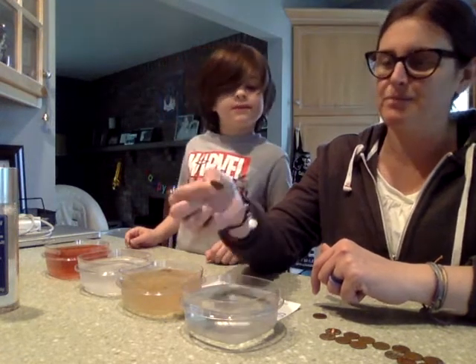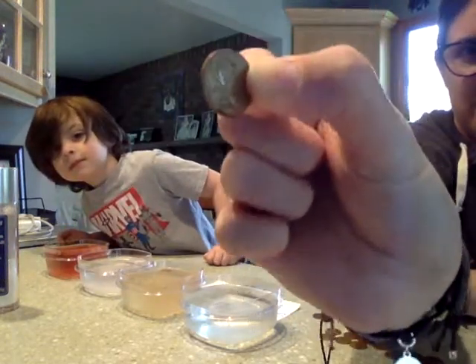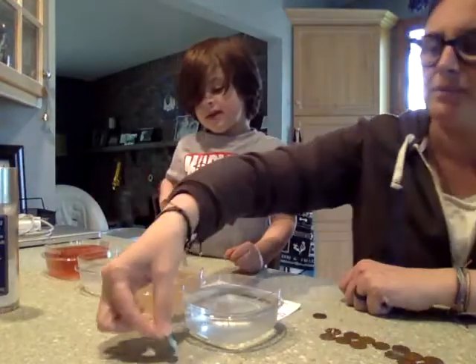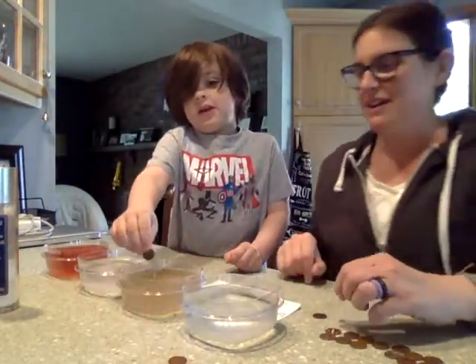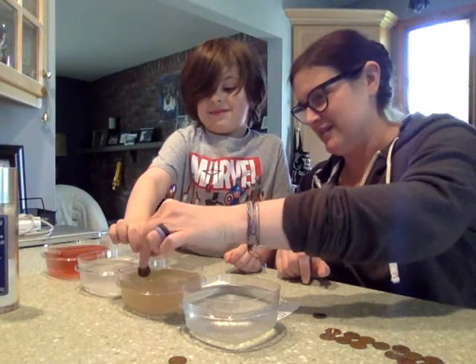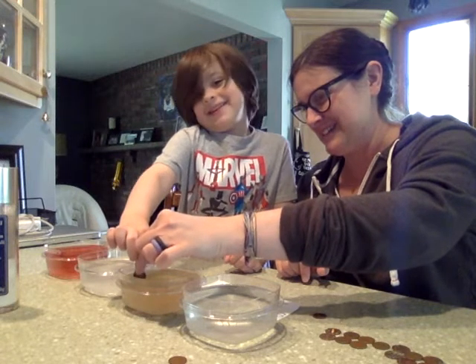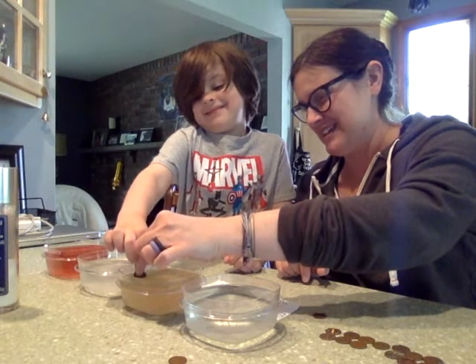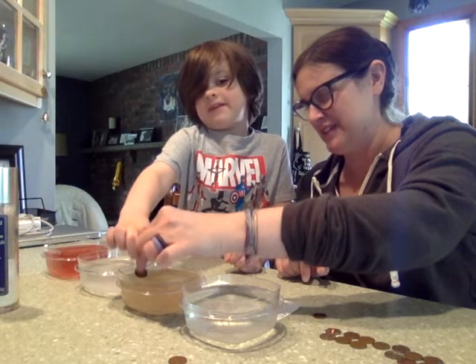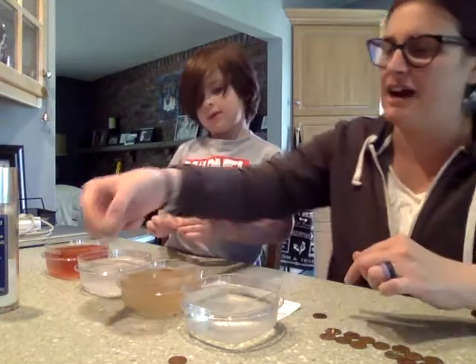Alright, I'll hold it as close as I can to the camera. Much like on the video, not much change. Okay, can you hold it halfway? 1, 2, no, halfway. There you go. 1, 2, 3, 4, 5, 6, 7, 8, 9, 10, 11, 12, 13, 14, 15. That's okay. So when you pull it out, not too much change there either.